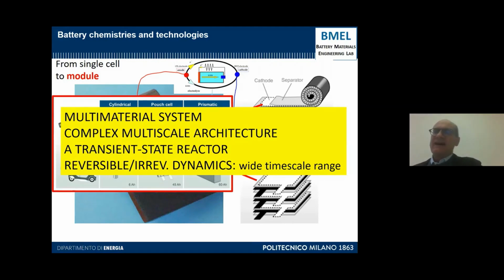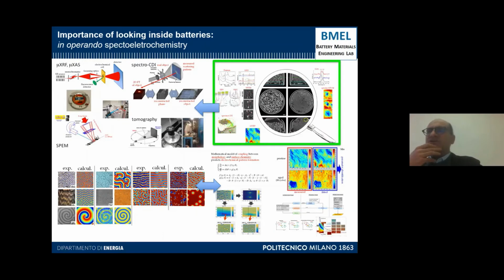Now, gaining insight into the properties and operation of these devices calls for capabilities of looking inside them, and this is precisely the task of in operando spectroelectrochemistry.